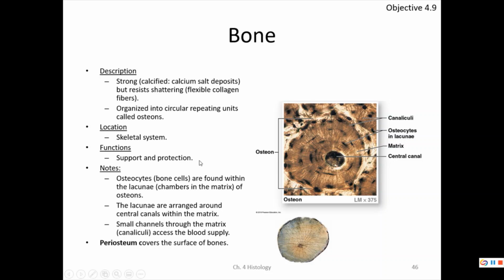Osteocytes live in lacuna matata. The lacunae contain our osteocytes, and they are trapped in this matrix of bone that's found all throughout here, a very mineralized material. In that matrix, there's a canal called a central canal, and radiating out of it are fine lines called canaliculi, which means little canal. And covering the outer surface is the periosteum.